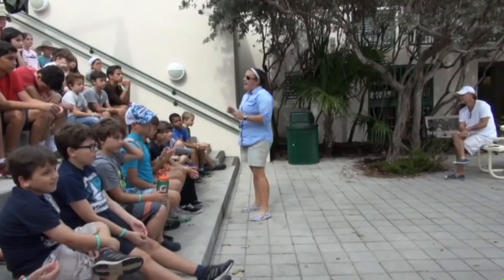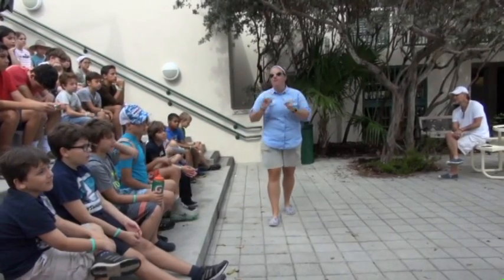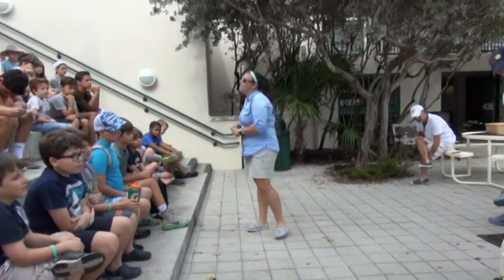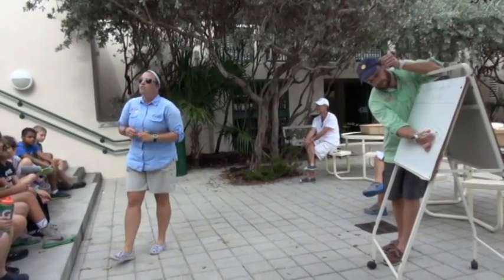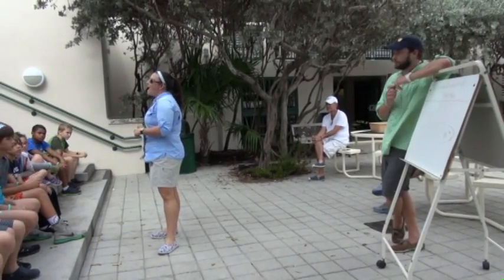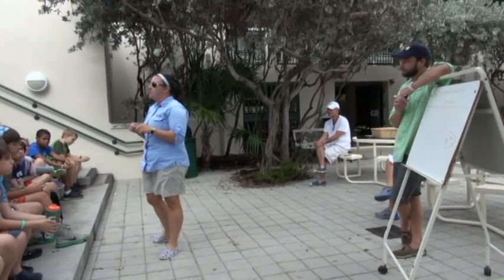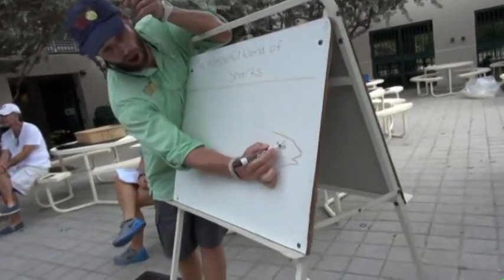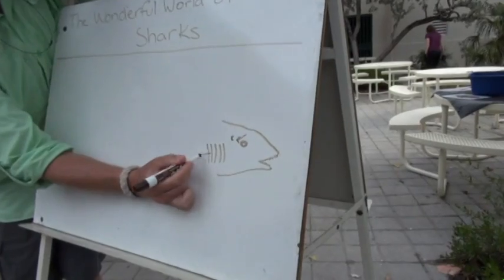So these guys actually have a little bit of an operculum. It's called a spiracle, and it usually sits right in front of their gills. So these guys pretty much just hang out at the bottom of the ocean floor, and they can pump little pieces of oxygen. You'll see their gill slits moving in and out, and they actually will use it to kind of hang out and get there.